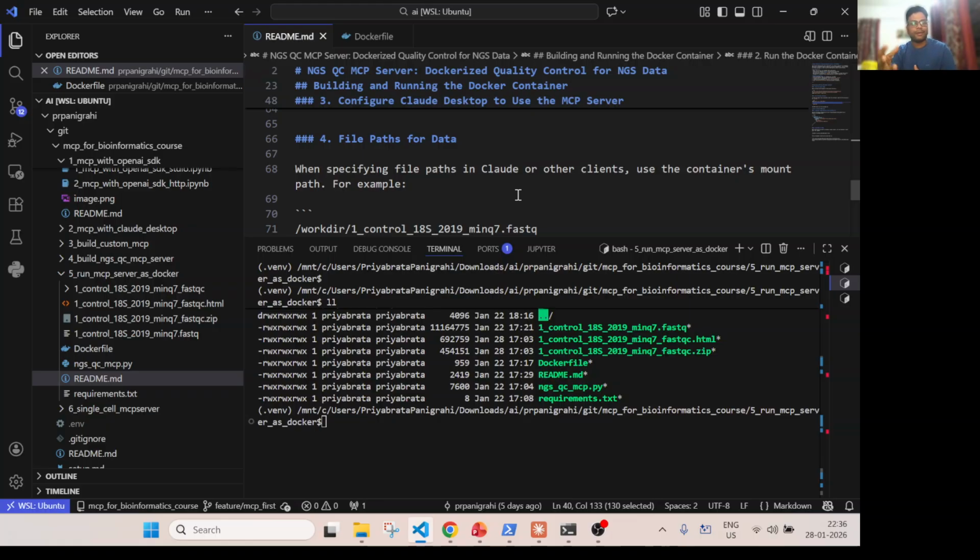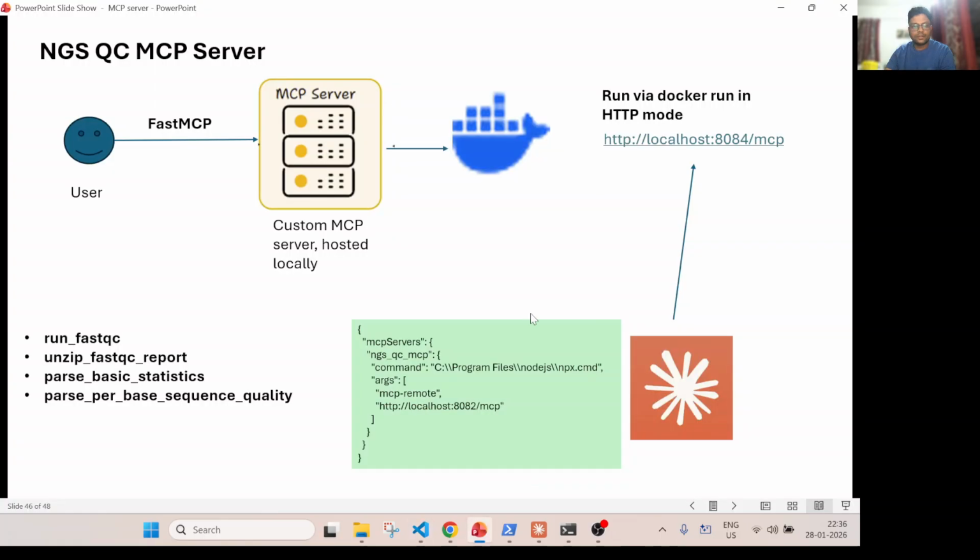That is one way. Or alternately, you can have a Lambda function start an EC2 instance, download the Docker image from the ECR repository, and launch it. You can do n number of things once you have the Docker, right? So that's what this video was all about.